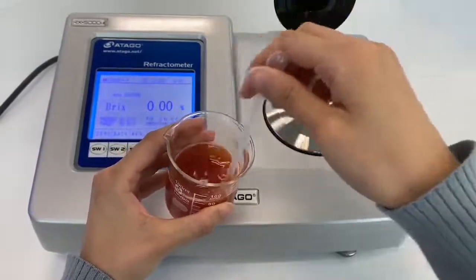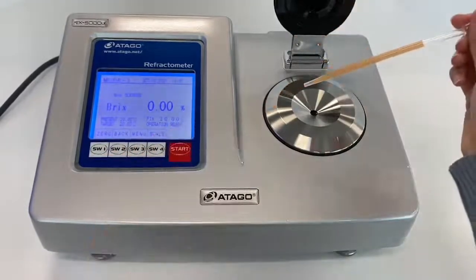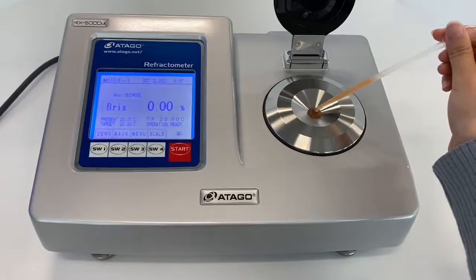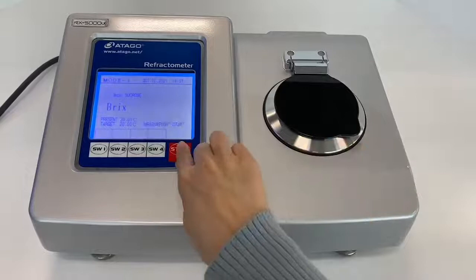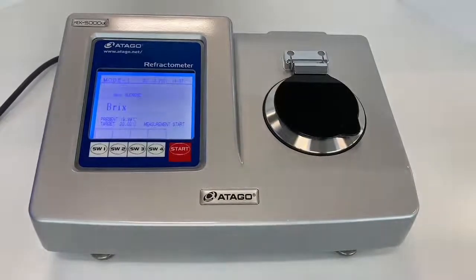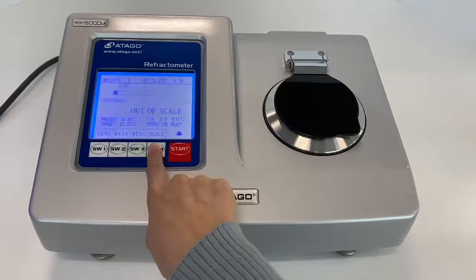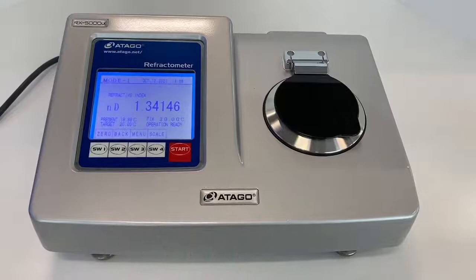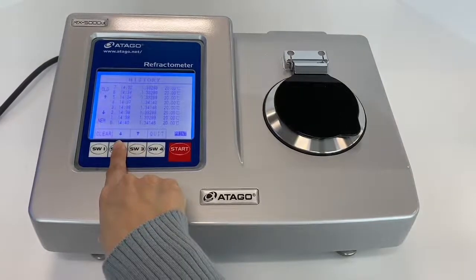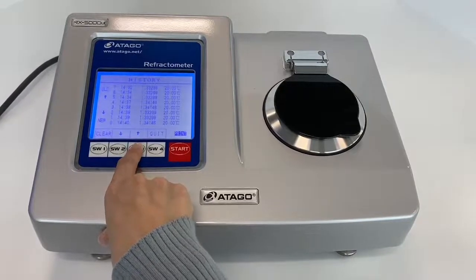We are going to use the same sample — tomato juice — for both RxI and Rxα. You put the sample on the sample stage and close the plate. The reading is 5.80%. To see the refractive index value, you have to click the button to change the display. And to see the measurement history, you also have to click the button.